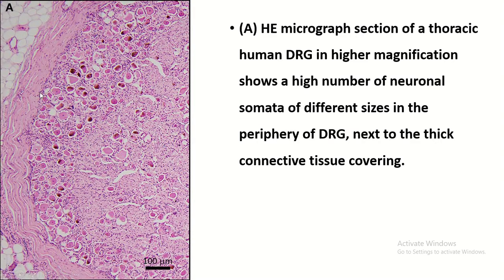This is the outer connective tissue coat and this is the peripheral portion. You see different shapes of nerve cell bodies of the sensory neurons are present — some are large, some medium size, and some small size. And this is the central portion of the dorsal root ganglia. You see the nerve bundles.